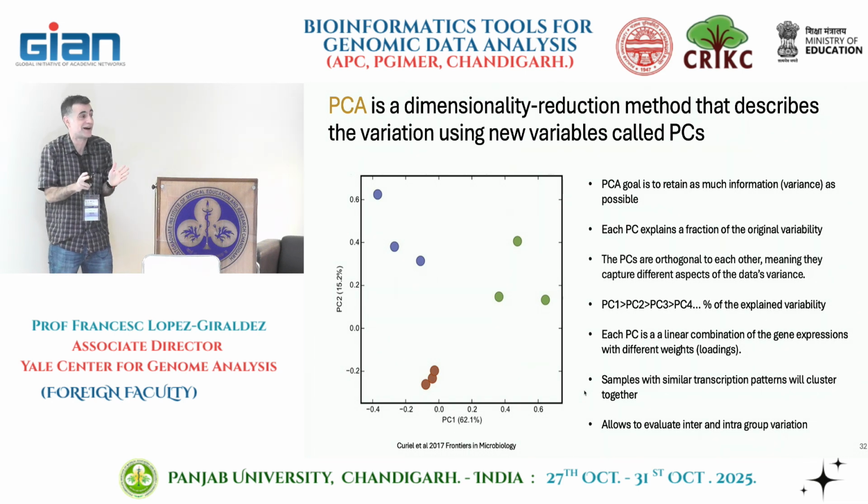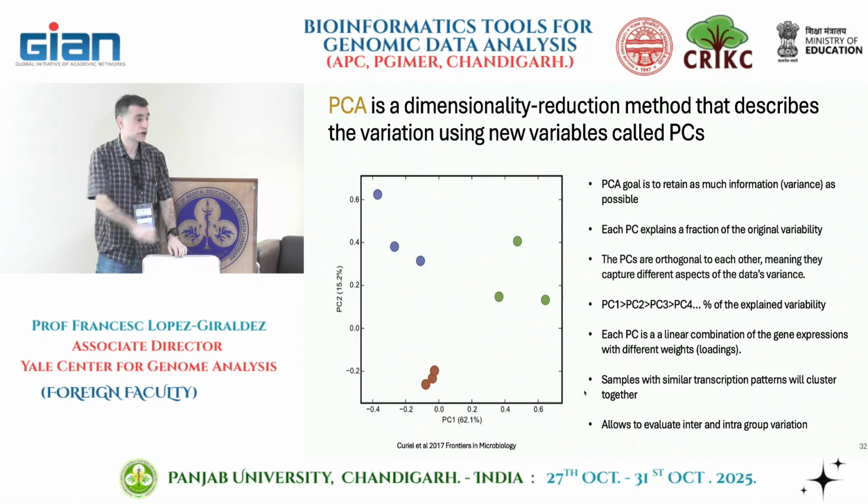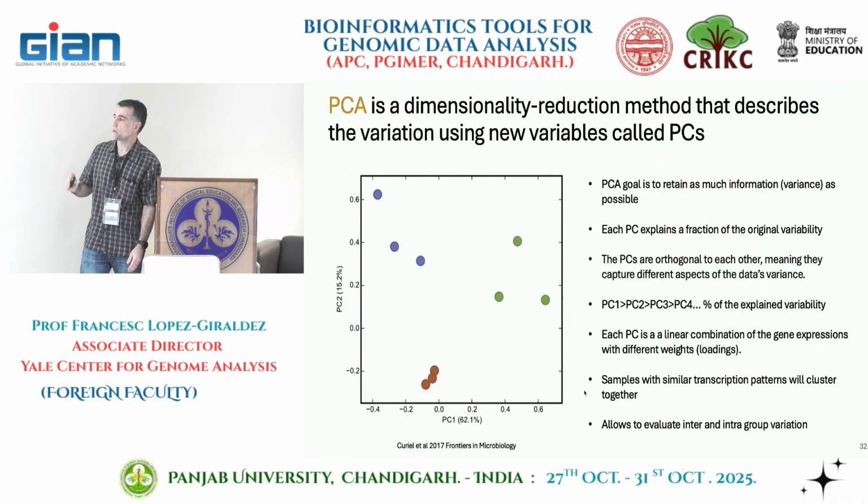But I'm saying the PCA is not going to lie. It's going to tell you your expectation doesn't fit. In the next slide we're going to talk about it. We can increase the replicates. Oh yeah, you can make decisions like this. Yeah, increase the replication. Totally. And 2 more important things.